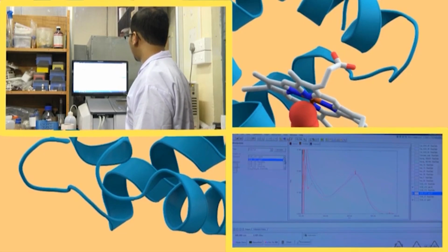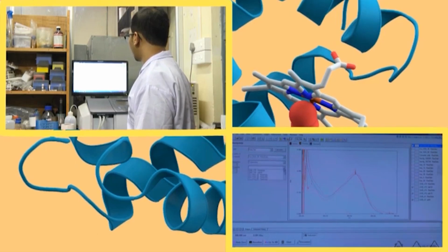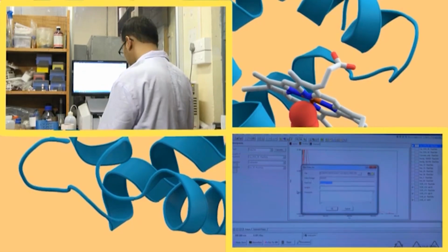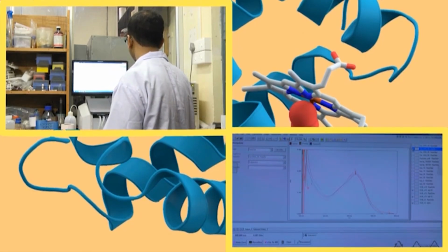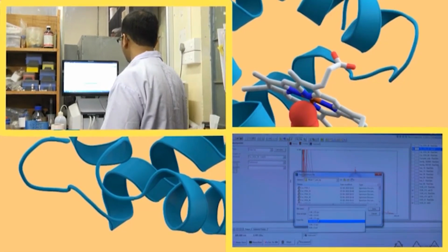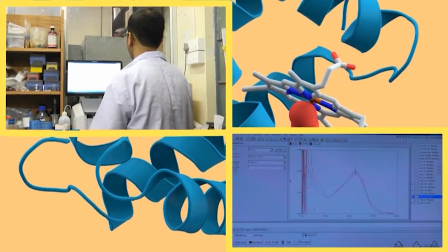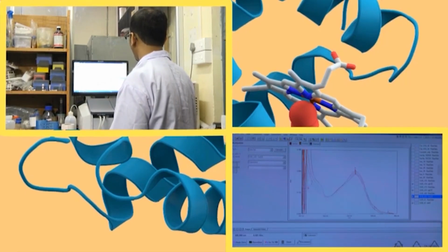Next I am doing 20. So, curcumin HSA 20 and HSA only 20. I am subtracting this one, SUB C 20, and now I will take this 30.